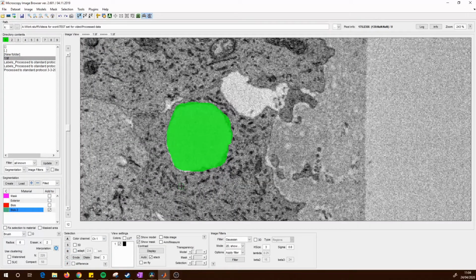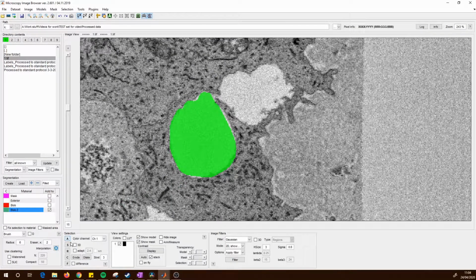That just about covers the selection panel here. Also, if you want to remove any selection before you add it to a material, you can do Control and click. So if you hold Control and click down, you can just erase the selection.